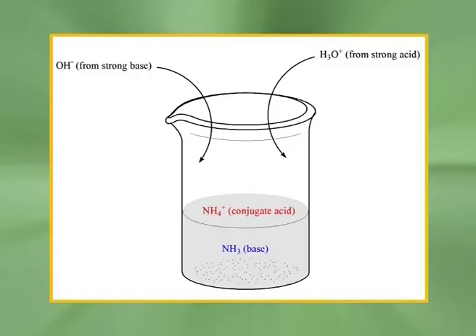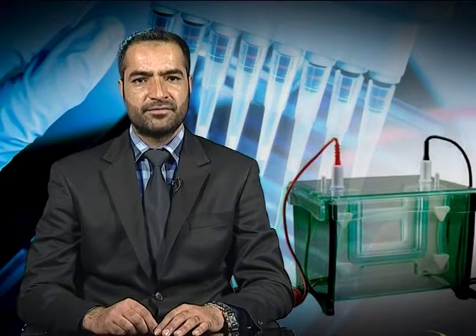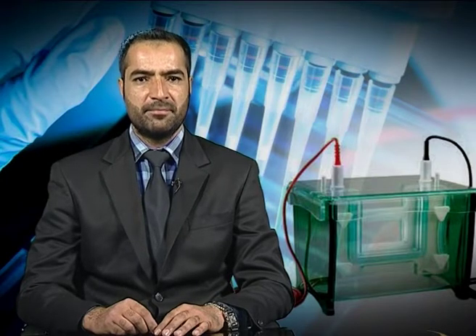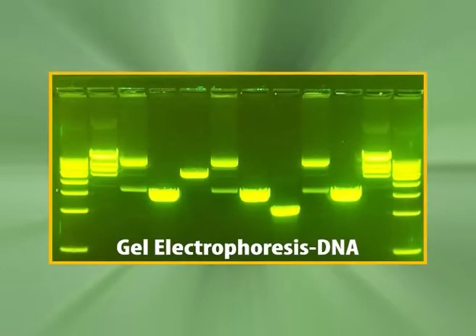In gel electrophoresis, molecules are separated in aqueous buffers supported within a polymeric gel matrix. Gel electrophoretic systems have several distinct advantages. First, they can accommodate larger samples than most paper electrophoretic systems and so can be used for preparative scale electrophoresis of macromolecules. Second, the character of the gel matrix can be altered at will to fit a particular application.